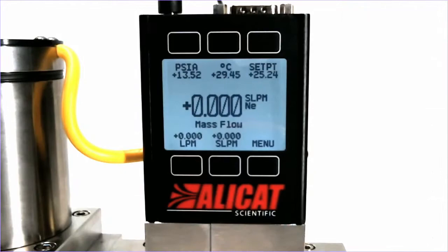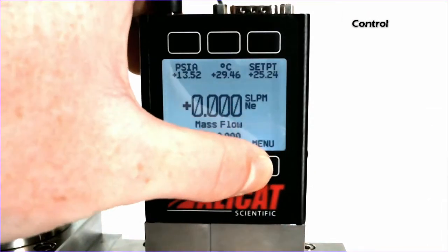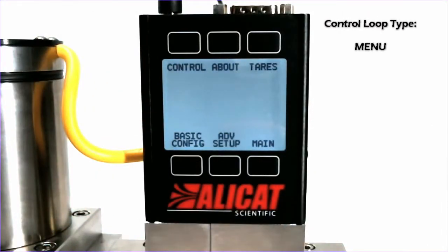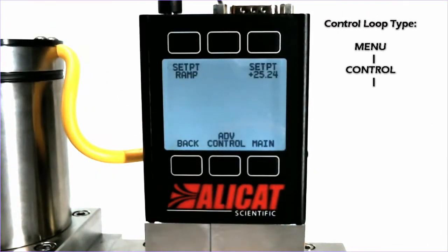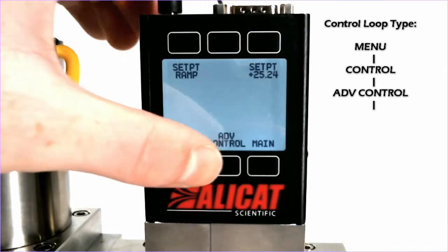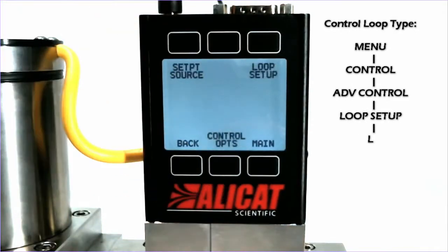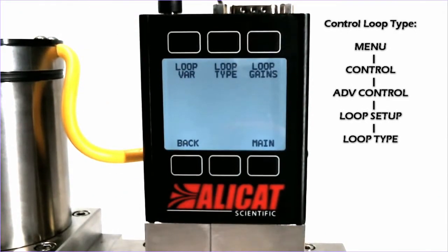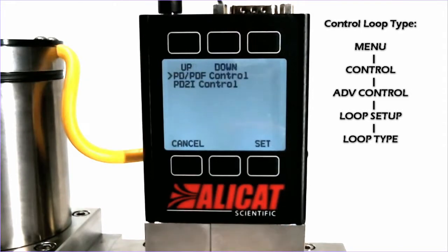In order to adjust the PID tuning, we will hit Menu, Control, Advanced Control, Loop Setup, and first we will look at the loop type.